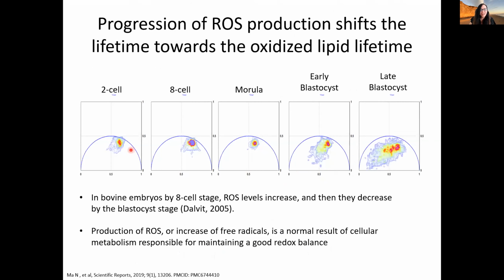And so using the Phasor-FLIM analysis, we see a movement of the fluorescence lifetime in each one of these developmental stages.